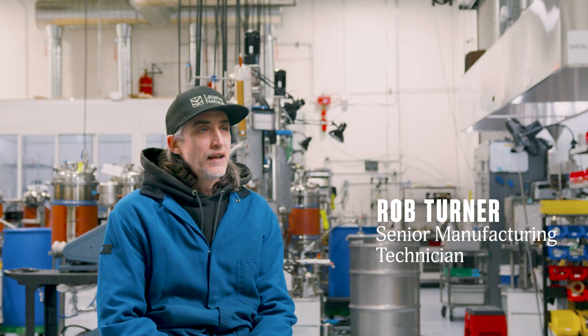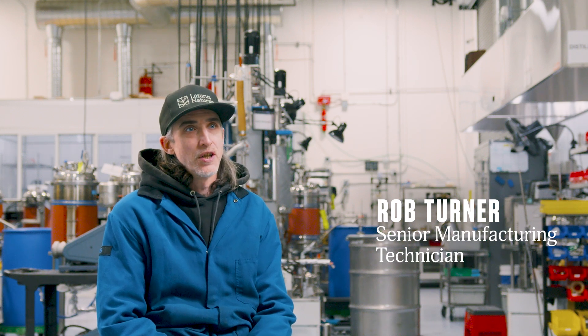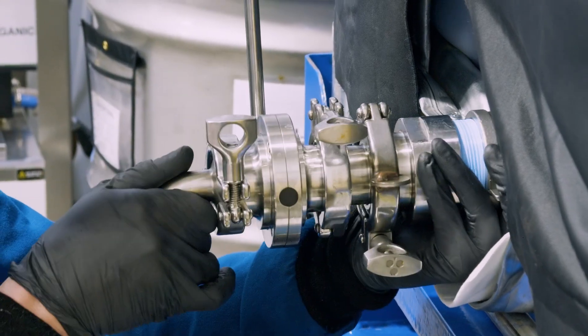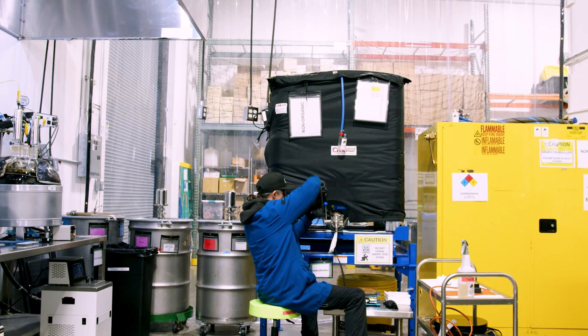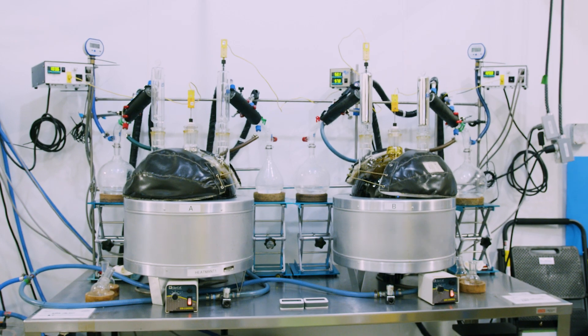In my capacity as a short path operator and station owner, I'm responsible for the intake of the crude, managing batches, and basically refining all of the crude that gets further either redistilled or used as an ingredient in products.